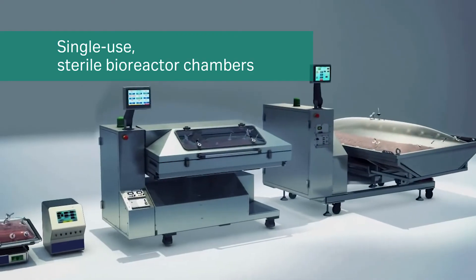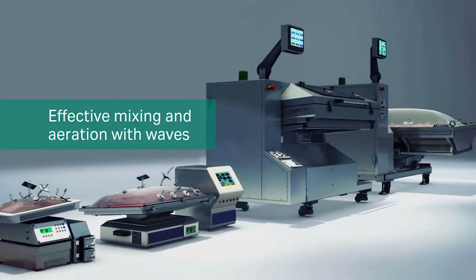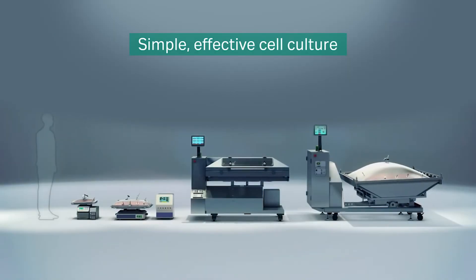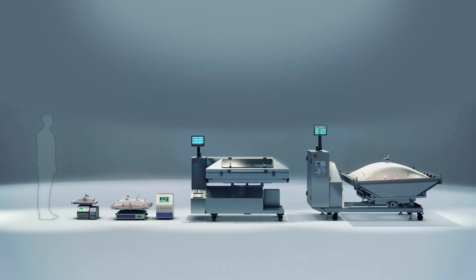Cytiva continues to invest in easy, effective cell culture. For over a decade, the Wave Bioreactors have been trusted for GMP manufacturing as well as research. Do you want simple, effective cell culture? Do you want proven technology? Do you want to start now? For more information, go to cytiva.com.